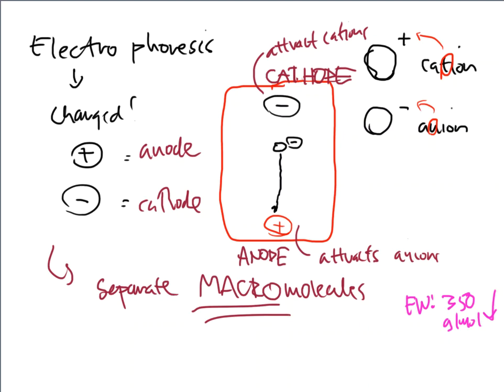So we never really dabble into the world of macro molecules. Macro. It's big, right? It's like a Big Mac at McDonald's. These are Big Mac molecules running around in a lab, and we're going to have to do something with them. All right, so it's my job to separate these Big Mac molecules, these macro molecules. So how do I do that?